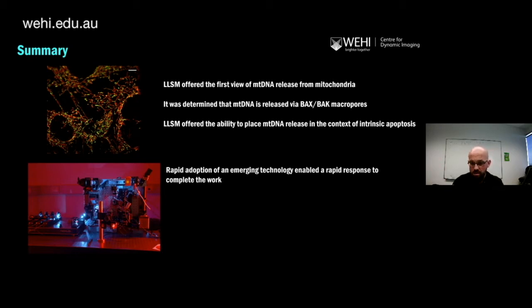So at this point, it was really good for us, because now we knew the system worked, and not just worked, but it stacked up against those that invented the platform, because we could put our data side by side, and it was, well, a bit biased, but I think ours was a bit better. So the question was, what should we do next? And that takes us to about 2018.